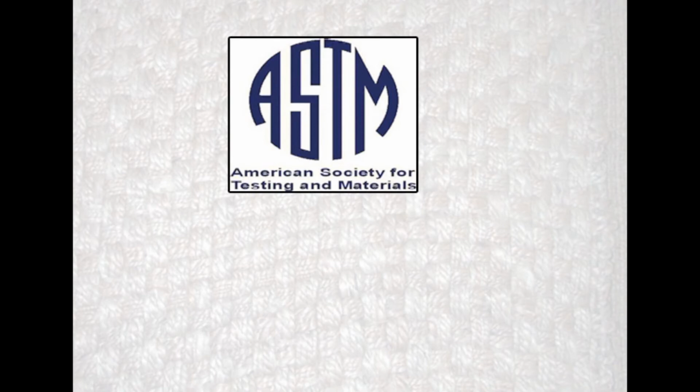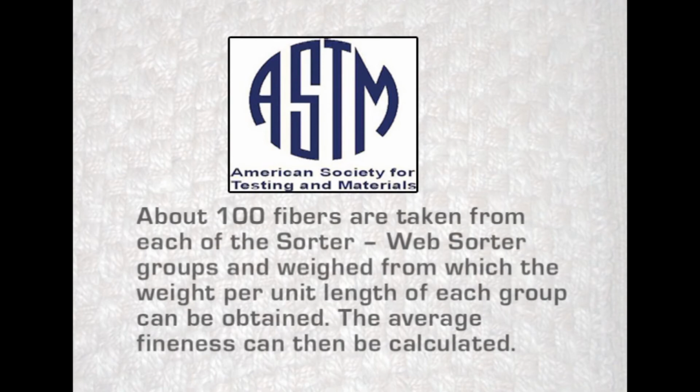Fibers like cotton have got non-uniform diameter along their length. Both tips are thinner and the center portion is thick. Also, there is a large variation in fiber length. In this case, the above mentioned method might not give right values. In the method described by ASTM, about 100 fibers are taken from each of the sorter web sorter groups and weighed, from which the weight per unit length of each group can be obtained. The average fineness can then be calculated.